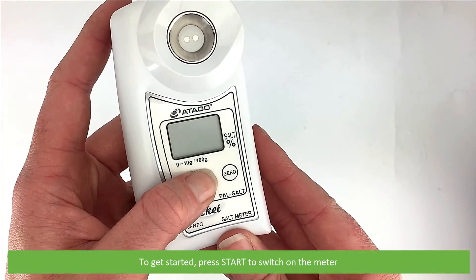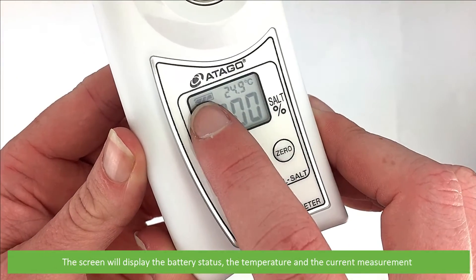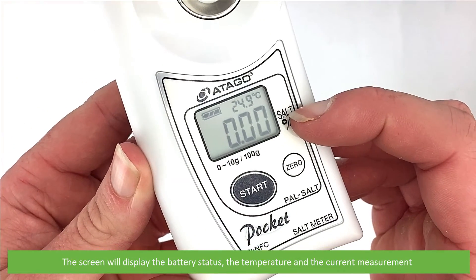To get started, press start to switch on the meter. The screen will display the battery status, the temperature, and the current measurement.